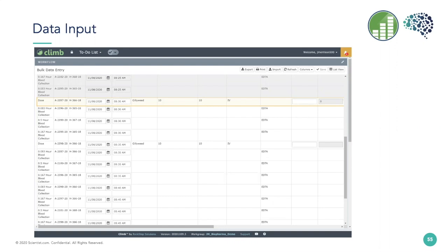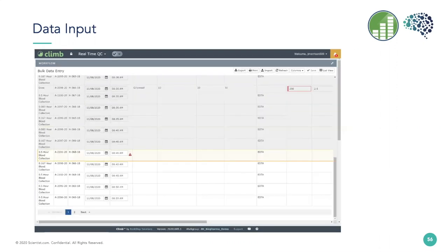Each technician can have their own version of the screen on their own device. They're going to autocomplete and sign off on their task. Everything's going to be perfect, right? Well, there's a reason that we call this talk Digitalizing Sample Collection for Dynamic In Vivo Studies, because we all know things change quickly when working with animals.